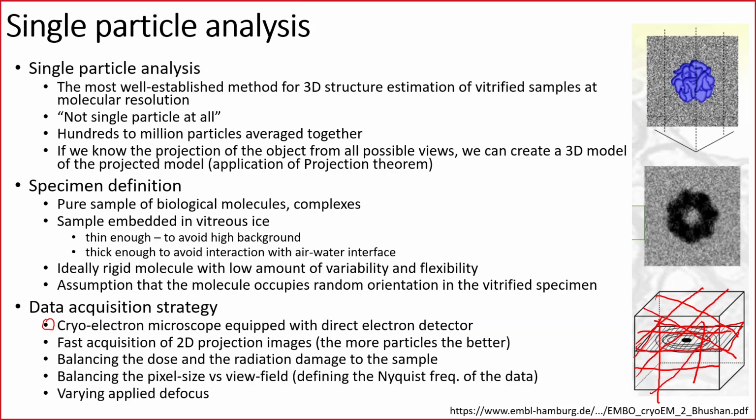So we need to find a balance for the amount of radiation that still gives us enough information, yet is not destroying the high resolution information of our sample.